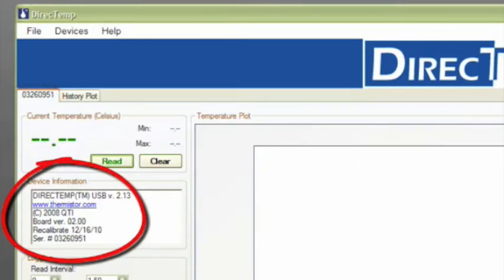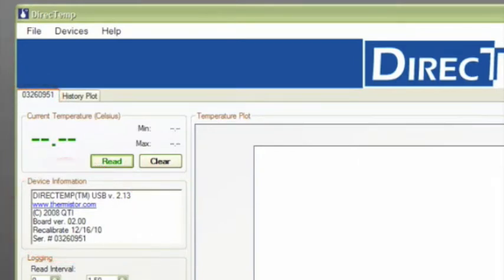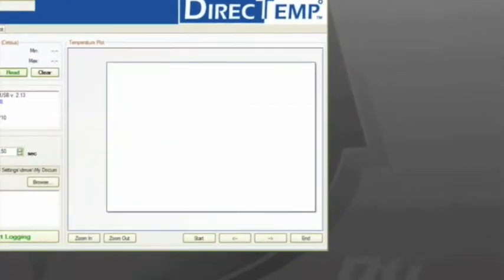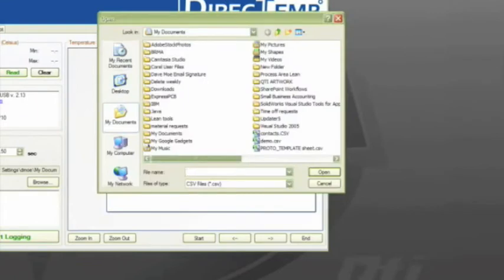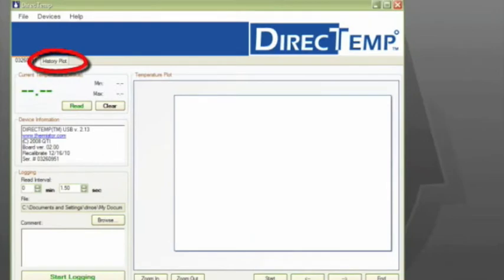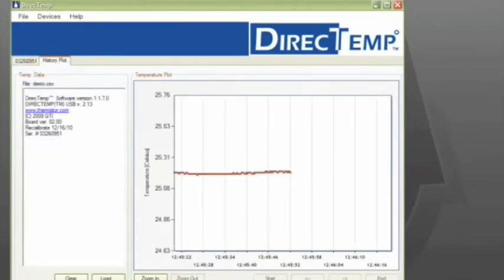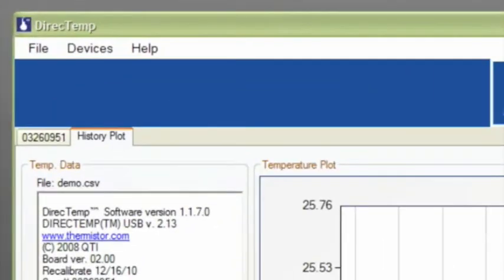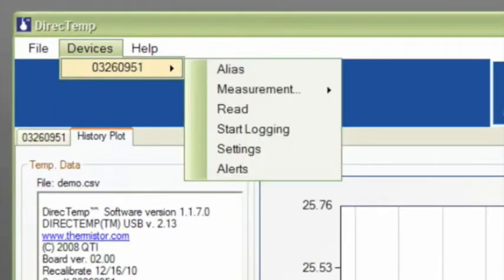Before we begin collecting data, let's go over the top menu options. First off, by clicking on File, you may open a previously saved file and view the data. Click on the history plot tab to view. When you click on Devices, it will show the serial number or alias of the probes that are connected.